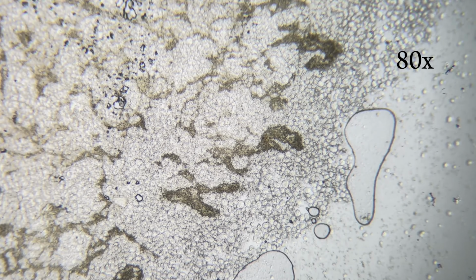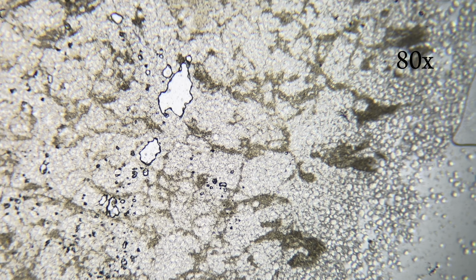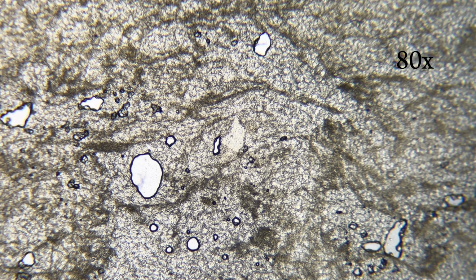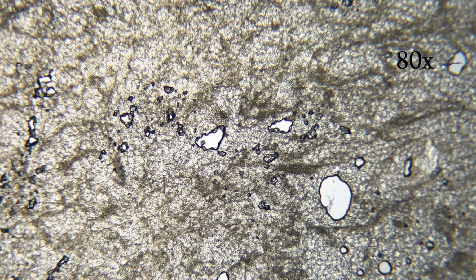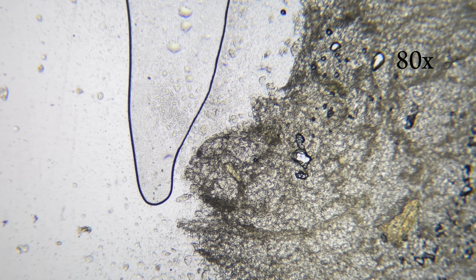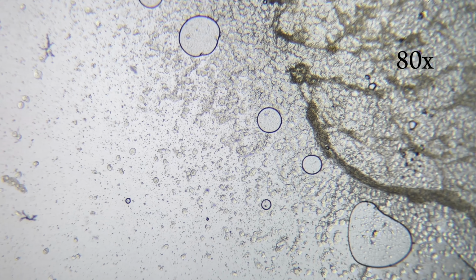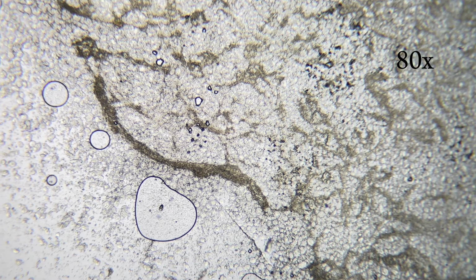At 80 times magnification, the bread sample immediately loses its familiar appearance. Instead of a solid piece, the structure looks light, uneven, and highly porous. Large translucent areas alternate with denser regions, creating a pattern similar to foam or a sponge. These rounded and irregular shapes represent the spaces where air and gas were trapped during fermentation and baking. At this scale, the bread already appears to be built around empty space. The solid material forms a loose framework that holds everything together.